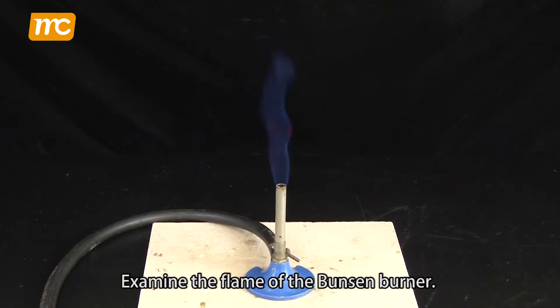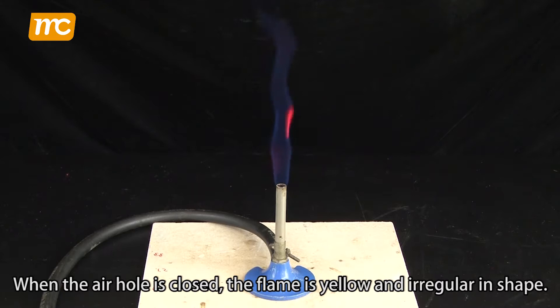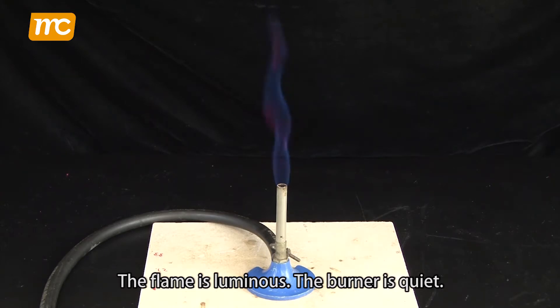Examine the flame of the Bunsen burner. When the air hole is closed, the flame is yellow and irregular in shape. The flame is luminous and the burner is quiet.